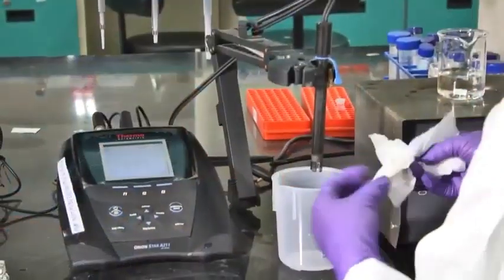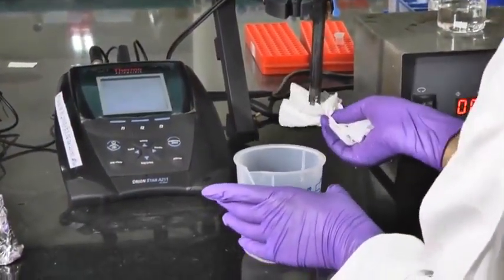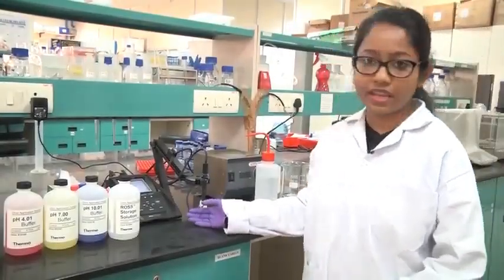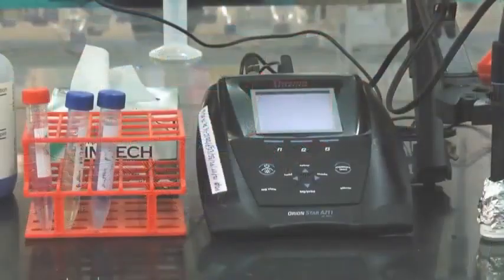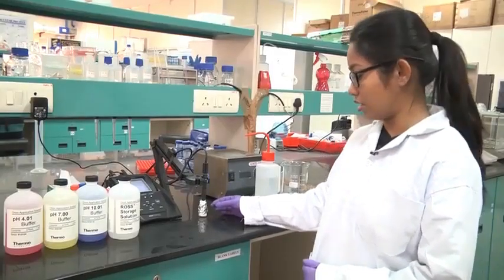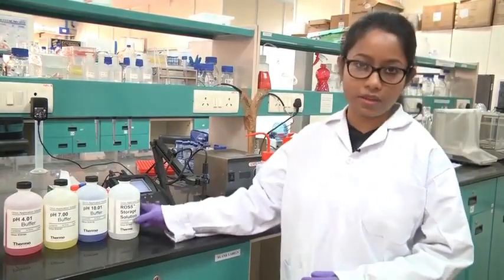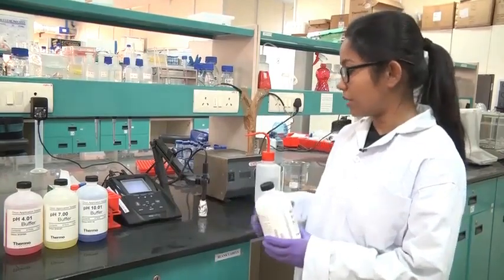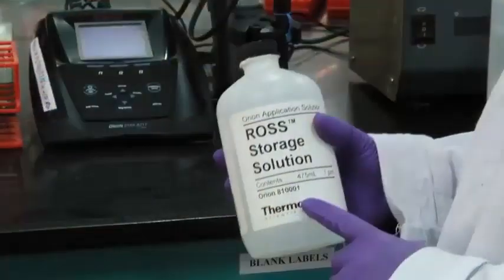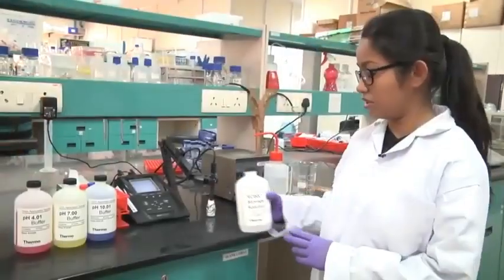And then, with the help of a tissue paper, we will wipe it down so that the electrode is dry. So now that I have already mentioned the pH meter, this is a digital pH meter, and the probe should always be kept inside the storing solution. The storing solution is provided by the manufacturer. Different pH meter companies all provide this storing solution, and it is a solution of 3 molar or 4 molar potassium chloride.